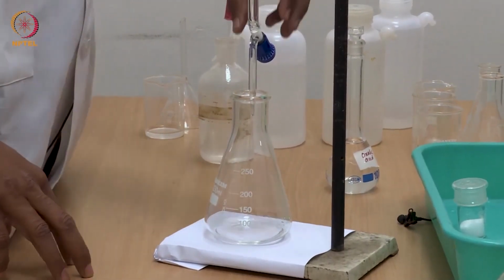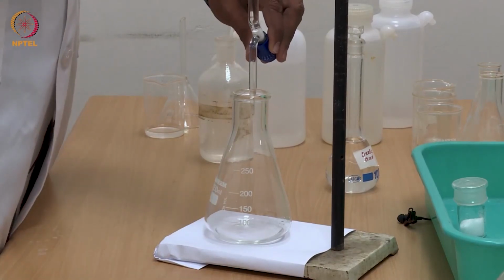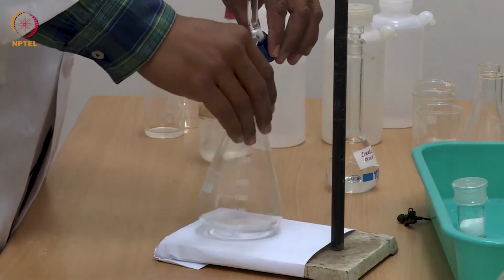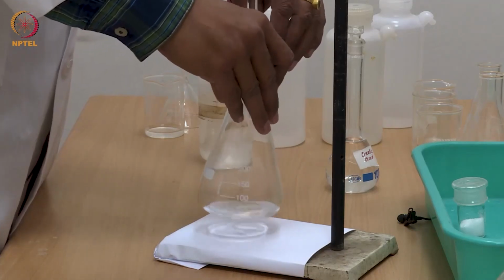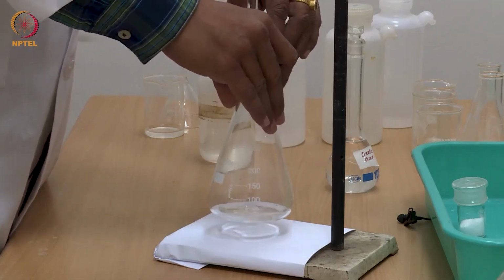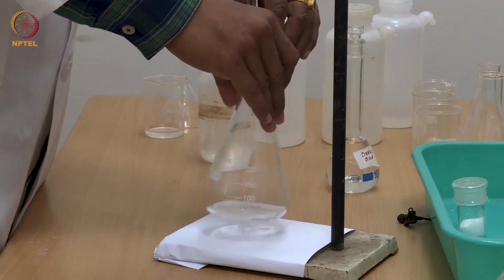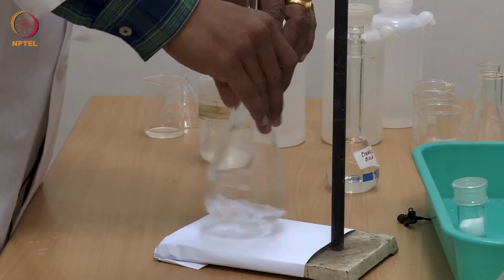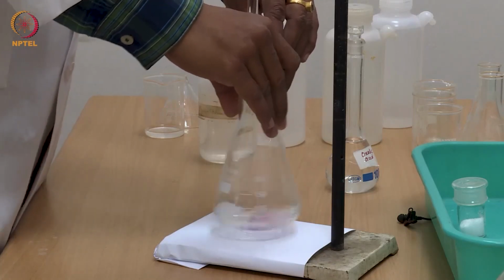So now when I start adding this NaOH solution dropwise, you can see the appearance of faint pink color in the solution, and immediately it disappears. Can you see the color? Faint pink color comes and immediately it disappears.